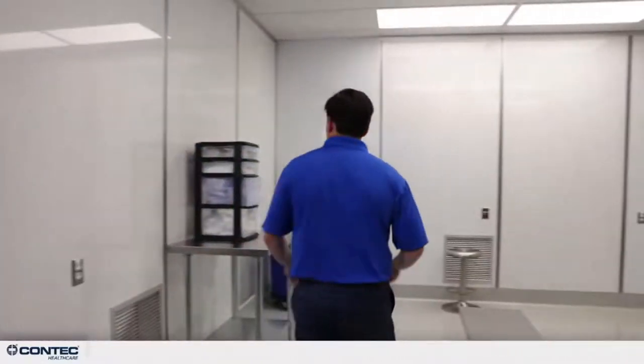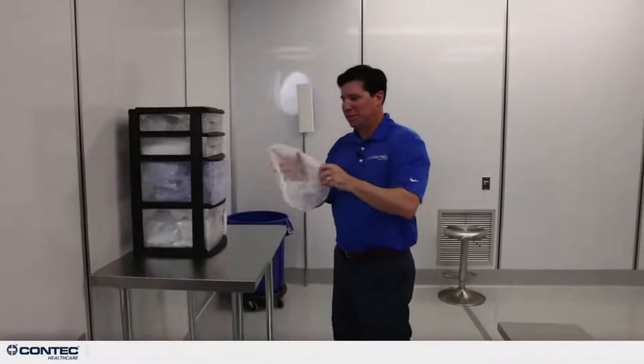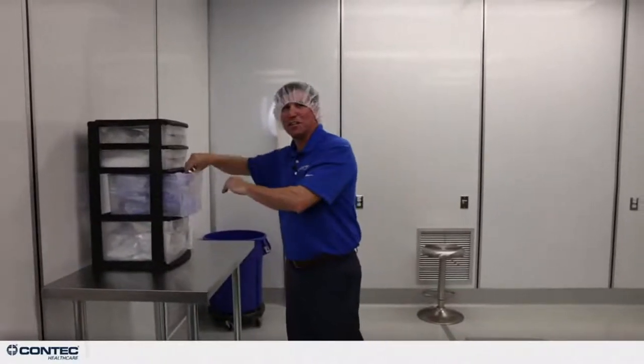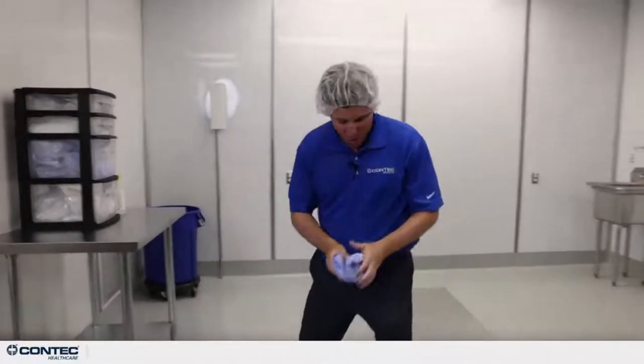Well, I can actually take a walk over to a clean room and show you guys how important this is. We tried to get Vanna White to come in, but Kevin's going to have to. I'm going to come over here and grab my bouffant cap and put this on first. We know this isn't the way the chapter currently says to do it, but we like to say cleanest to dirtiest, so we start with the bouffant cap first. Then I've got my shoe covers here, and I'm going to sit on the bench.